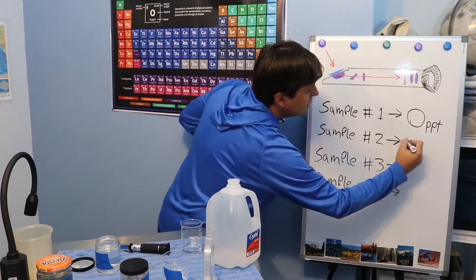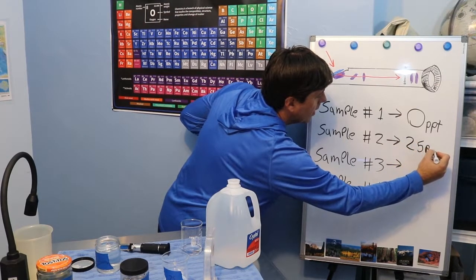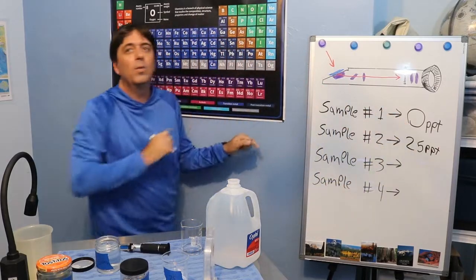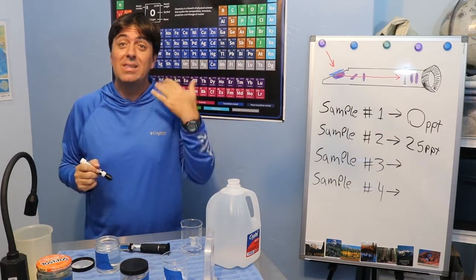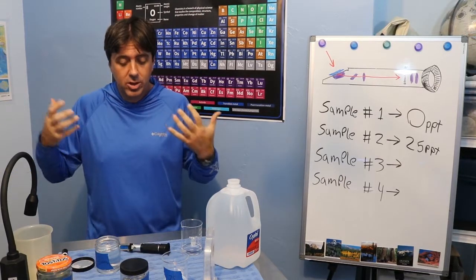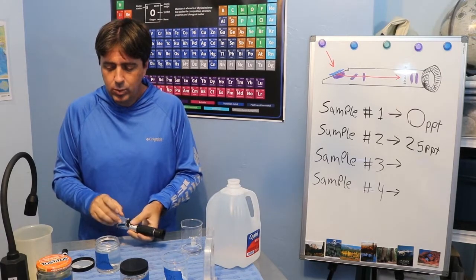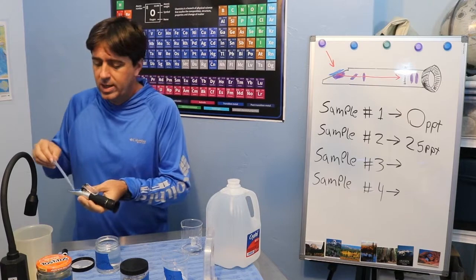Now, if you noticed in the video, it was actually kind of cloudy and it had just rained. That might have actually brought the salinity a little bit down too. Also, there's canal discharge, things like that. So it makes sense that it would be a little bit less than oceanic water.